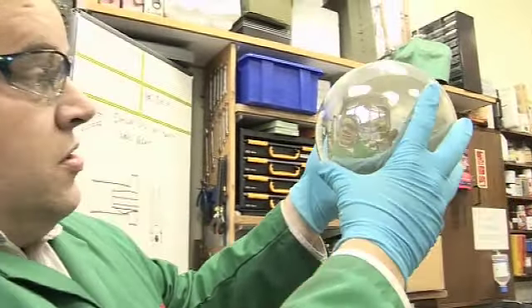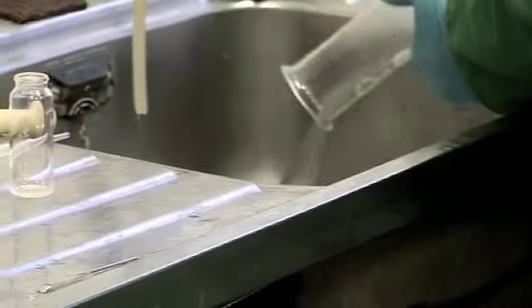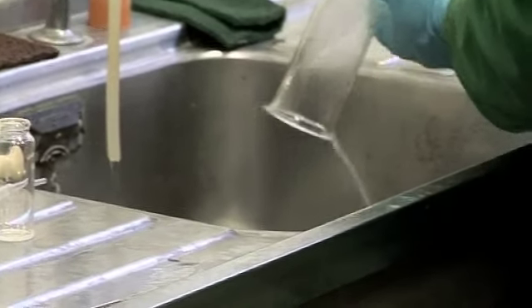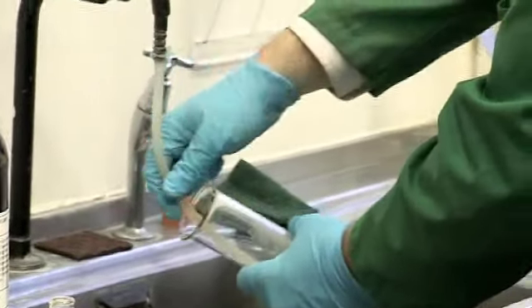So now what we need to do is remove the rest of the excess solution and wash it with water, which will then stabilize the mirror so that we've mirrored the vessel. We've washed it with water because the byproducts in this reaction could contain quite energetic salts of silver and we don't want any energetic reactions in our nice new flask.